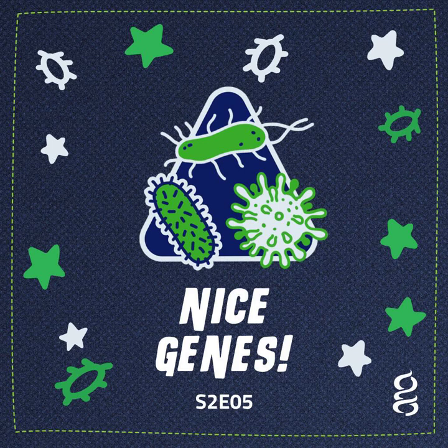Grabbing samples, extracting the DNA, sequencing it, and analyzing the results. It's a basic formula for any genomics work. This isn't just about bat poop. It can also be used for identifying and tracking bacteria and viruses that are all around us, and some which can even make us sick. Scientists around the world, repeating these steps over and over, are progressing our understanding of these microbes so we can stay ahead of them. It's a train ride that isn't slowing down anytime soon. And as we've seen recently, this issue is only just beginning to thaw out.